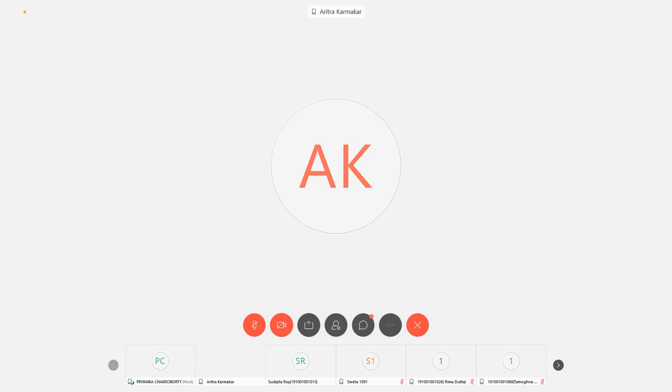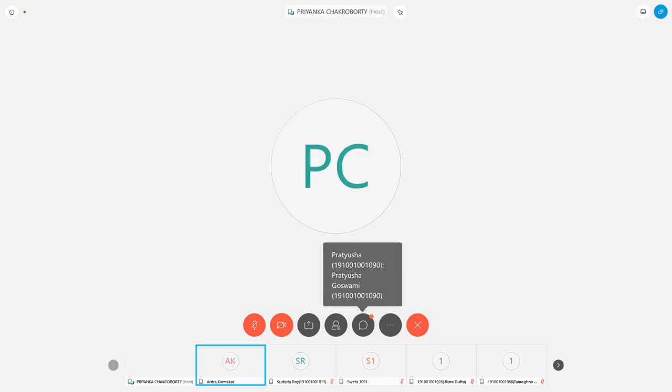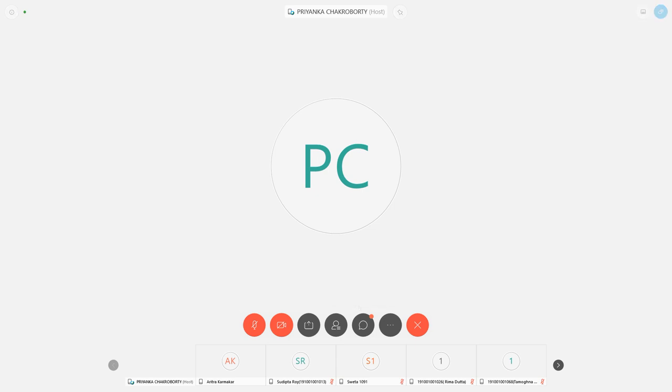The smell of ester: acid and alcohol react to give you ester. So if we hydrolyze ester in basic or acidic medium, it reverts back to the alcohol and acid. In this reaction, we are taking alkaline phenolphthalein.